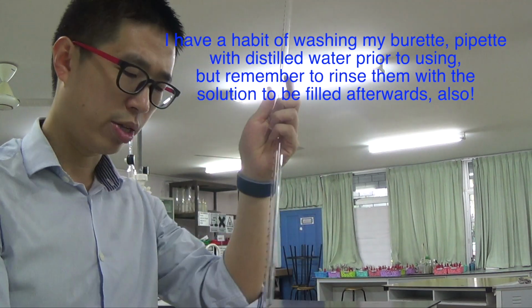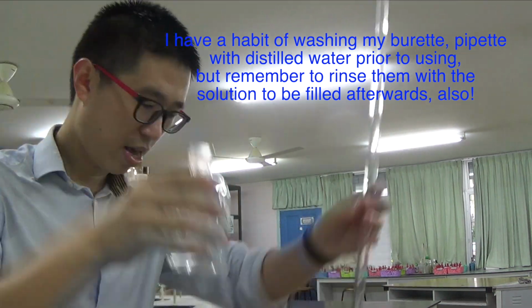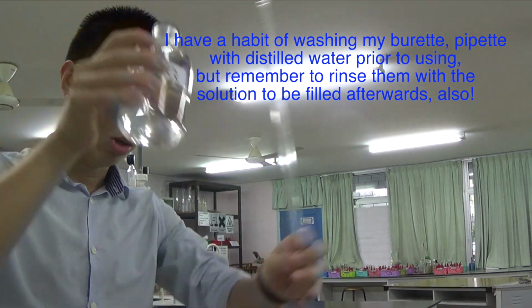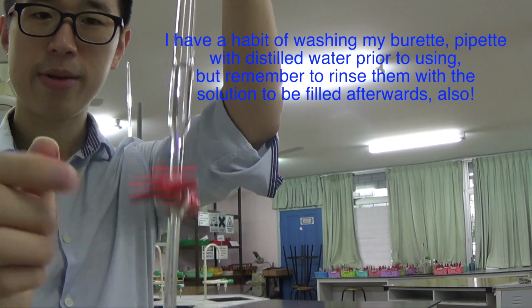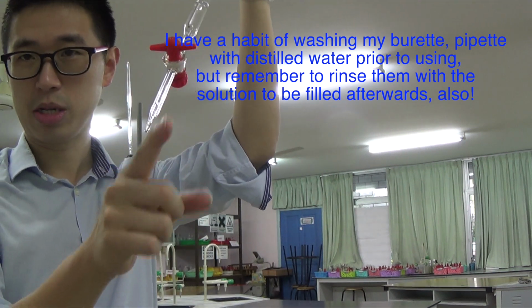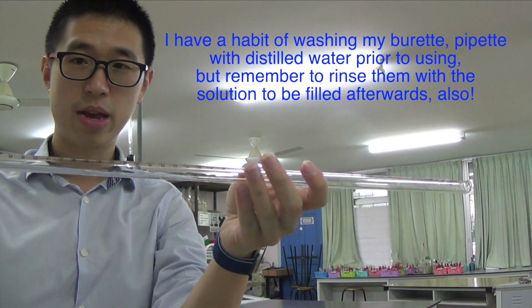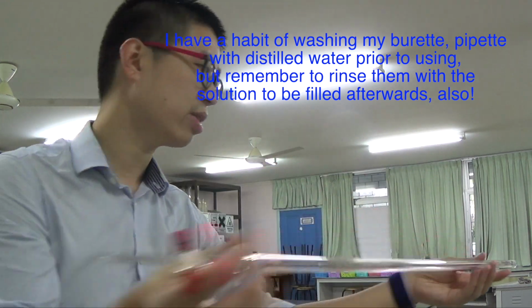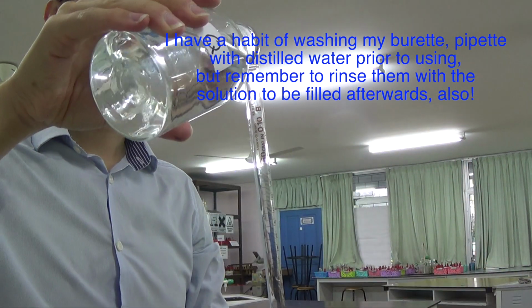I'm just going to quickly rinse my burette before I forget. So put a little bit in there for rinsing, maybe just a little bit more. You don't need to fill the whole burette. Roughly around that much should be alright. Make sure you open the tap so that this bit is rinsed with the solution that you're going to fill it with as well. Before I do that, maybe I'll roll it around so that I am thoroughly rinsing my burette.